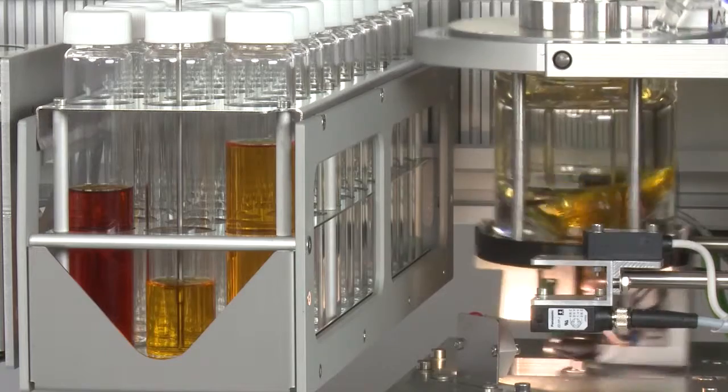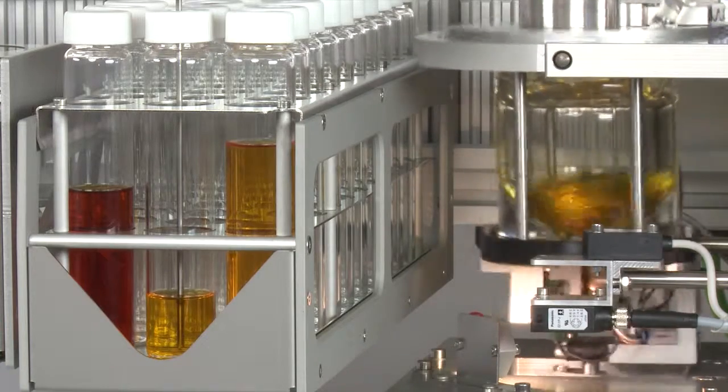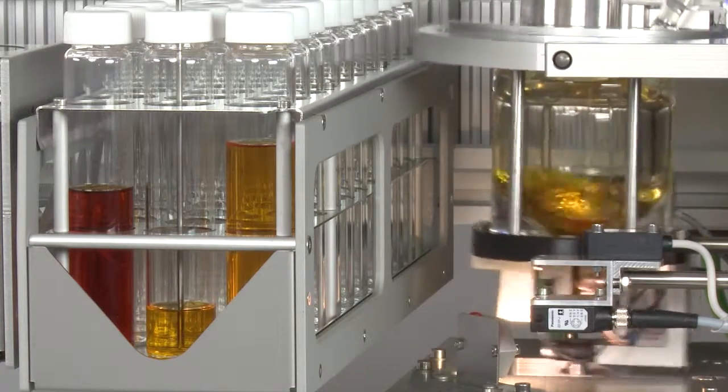Depending on the method definition, the container will be rinsed for the quantitative transfer of the analyte.